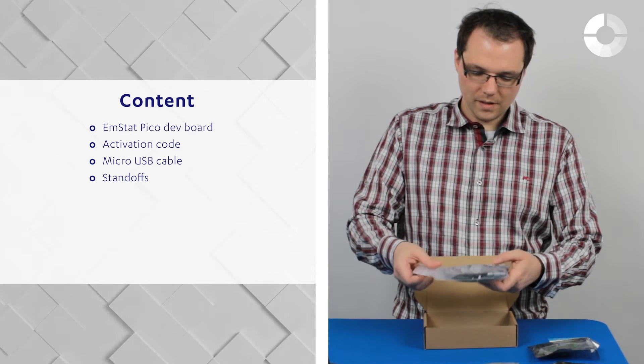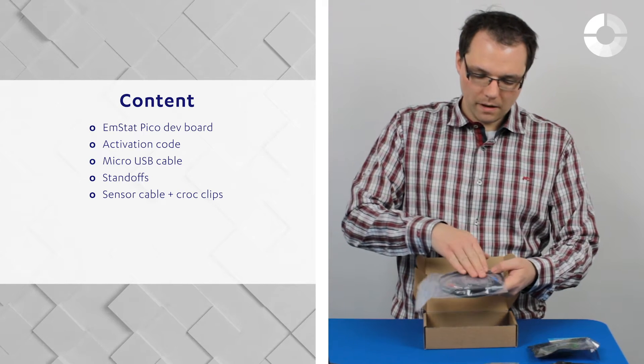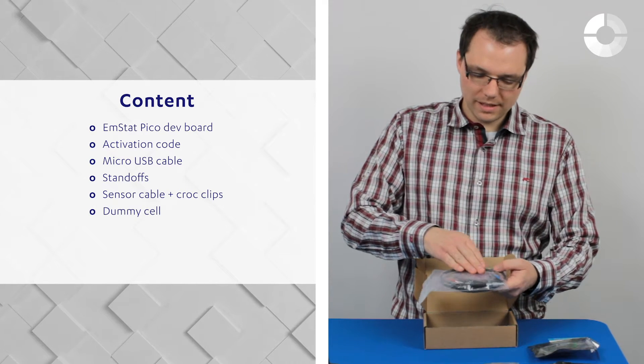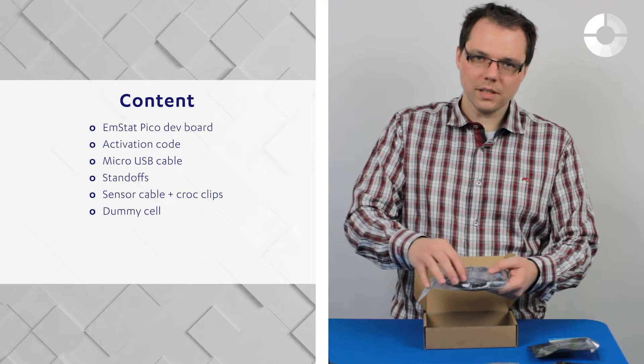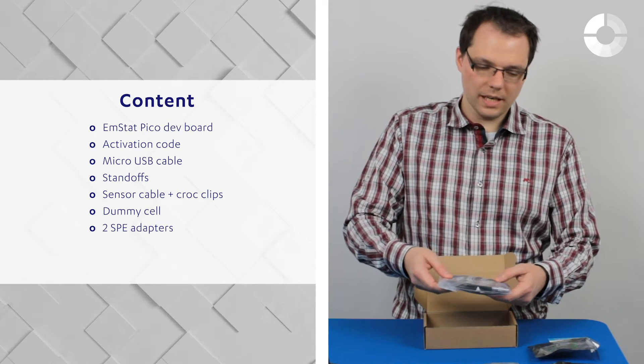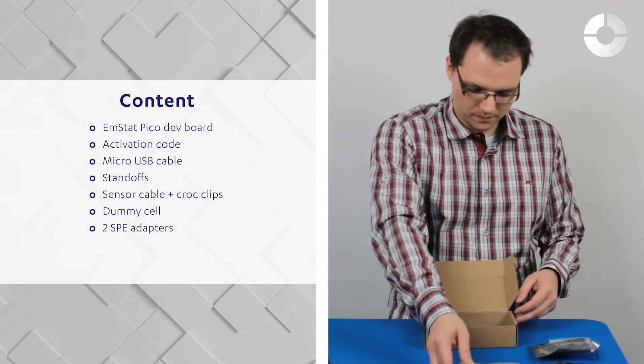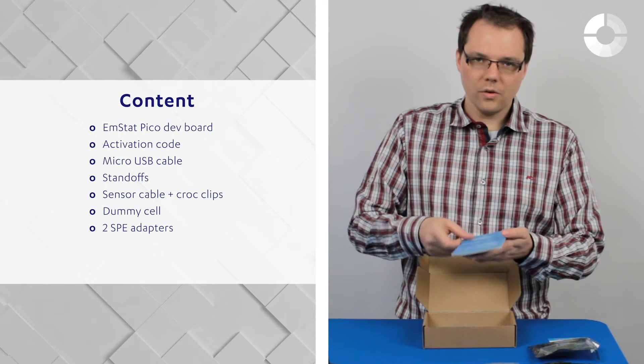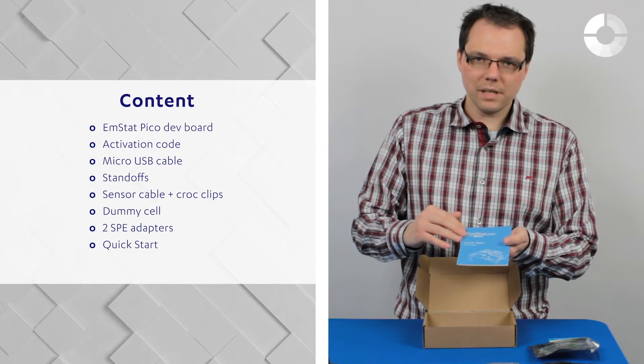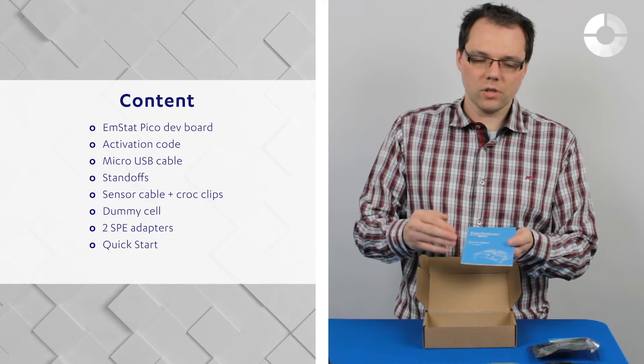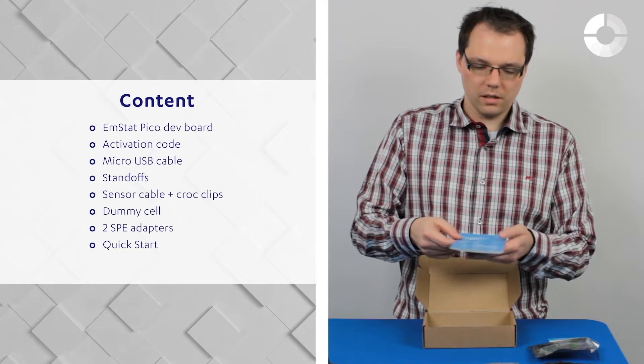A sensor cable, one of our dummy cells, four crocodile clips and two adapters for screen printed electrodes. Furthermore, you have a quick start which is a step-by-step instruction of what I'm doing here today.